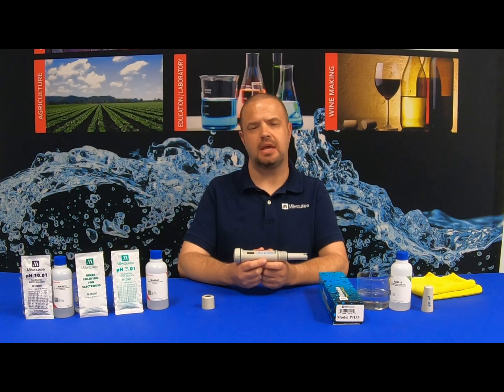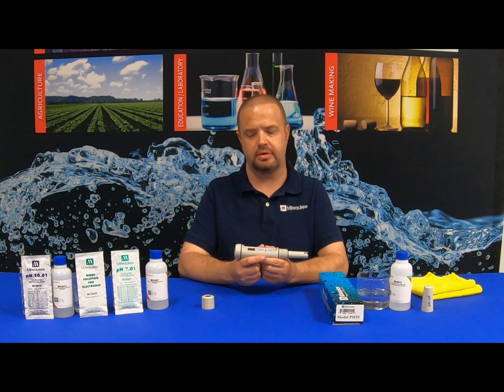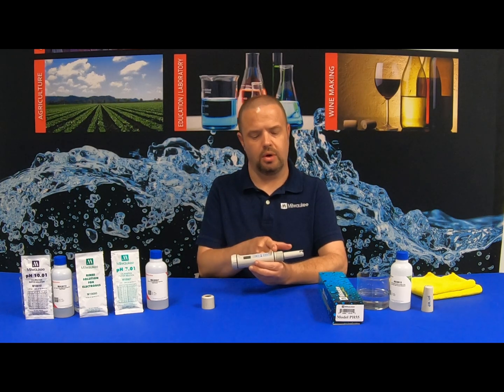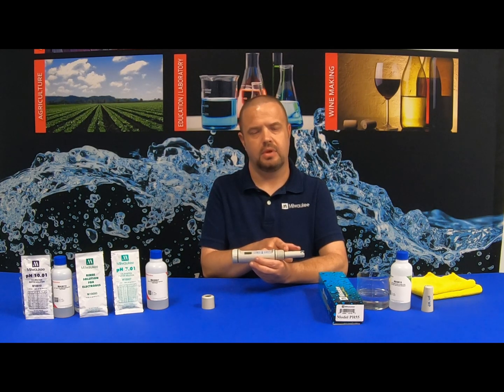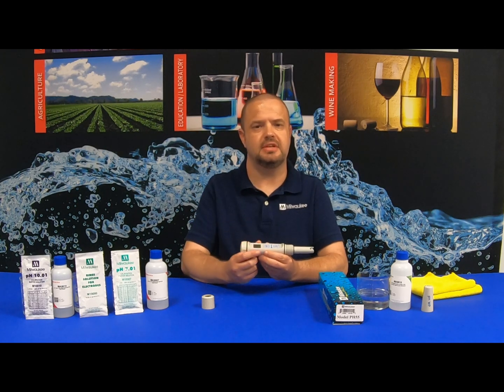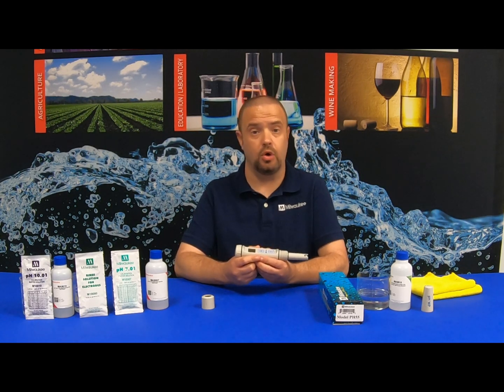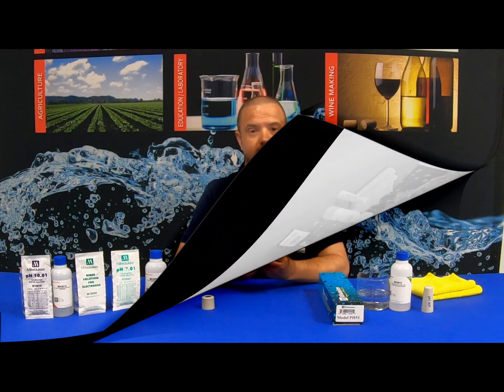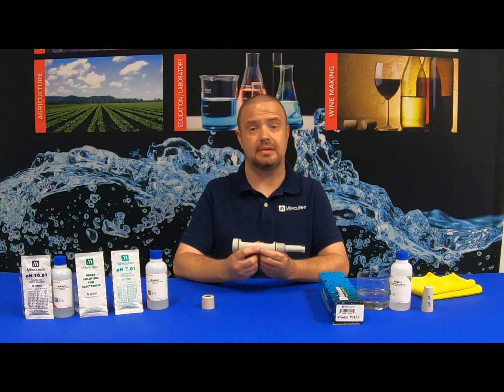On the Milwaukee Instruments PH55 tester, you will notice three separate gaskets on the unit: one where the battery compartment is, one on the locking collar, and one on the electrode. Although this unit has three gaskets, this is a water-resistant unit — it is not waterproof. It is not intended to be fully submerged in samples you are testing. Be sure the gaskets are properly seated when replacing the batteries and the electrode.